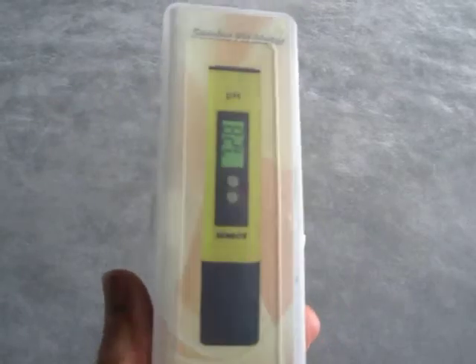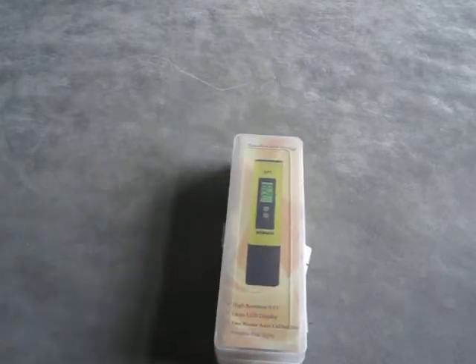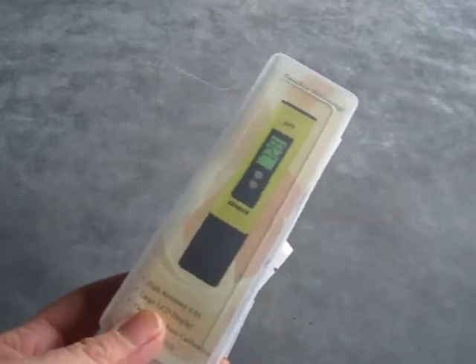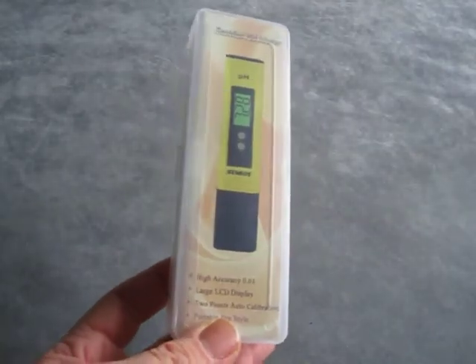Today we're reviewing the Semlos pH meter. My son has already used one of these and taken it to school — they use it in the science labs. They're very accurate and eminently more reusable than the likes of litmus paper.